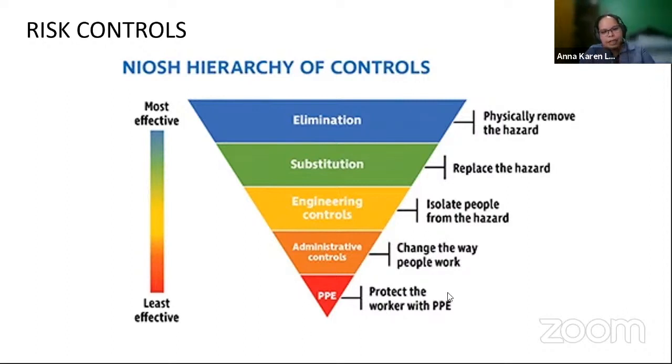Lastly, yung pinaka-last level of defense or risk control will be your PPE. So actually minsan parang kino-consider siya na baligtad, di ba? Parang first line of defense ko is PPE. Pero actually it's the least effective. And so parang last resort mo na siya. Although of course this is the one that is mas nakikita, siya yung mas obvious, but actually it is at the last level of defense na. So this is meant to protect the worker, given na hindi lahat na control can be provided by the other risk controls, then dito tayo papasok.